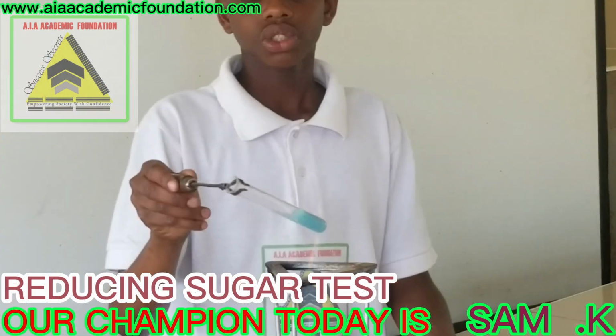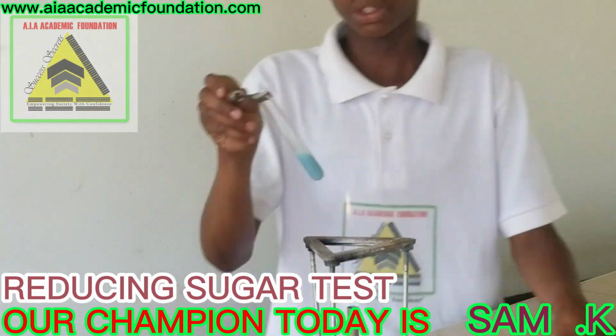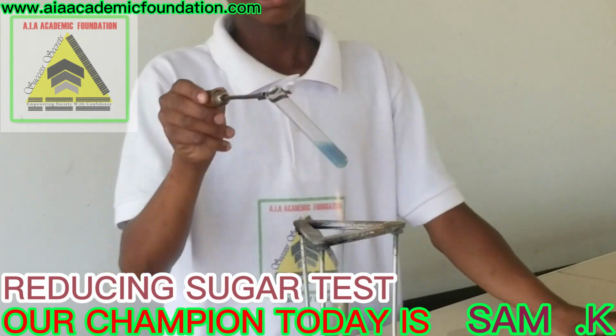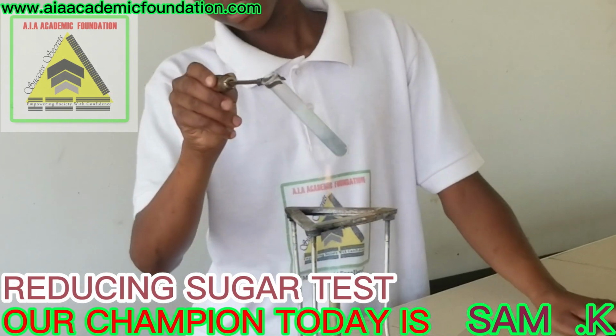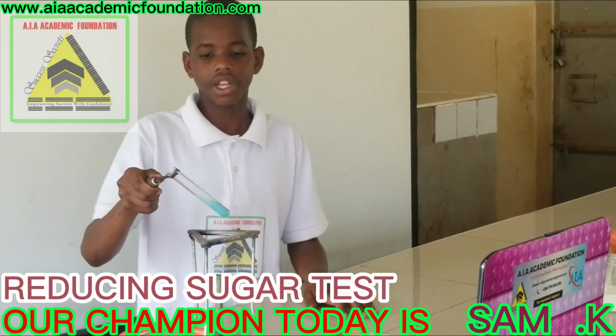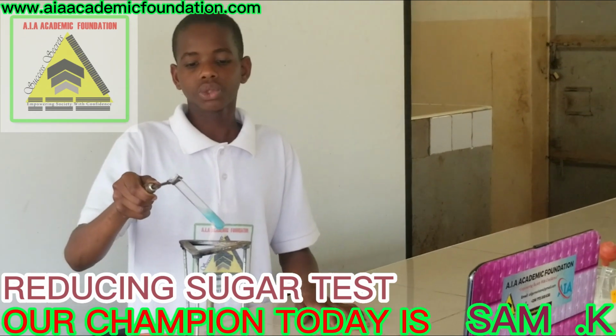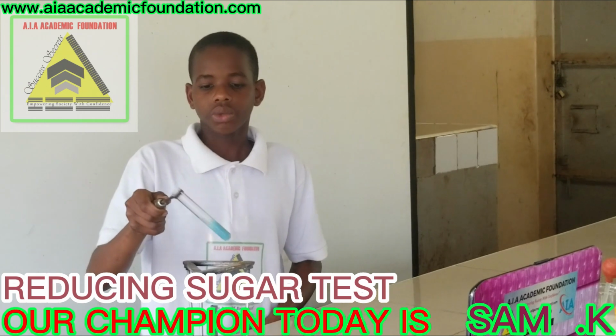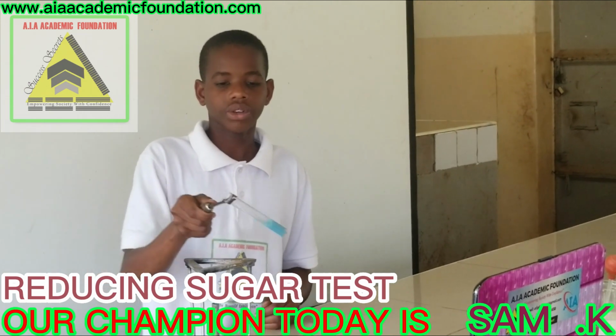That will happen if milk contains reducing sugars. But if there are no reducing sugars, the solution will remain pale blue, since our reagent is pale blue. With reducing sugars, it will turn from blue to green solution, then from a green solution to a yellow precipitate, then finally to a red precipitate.